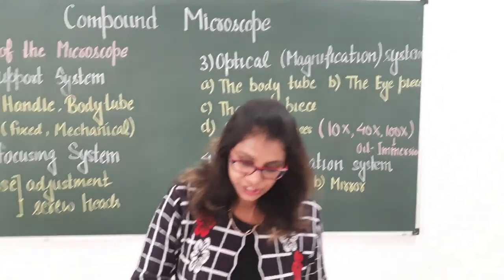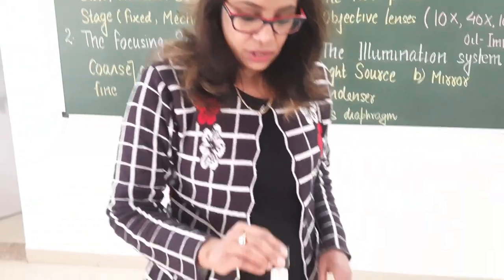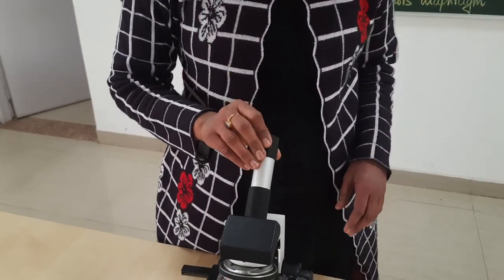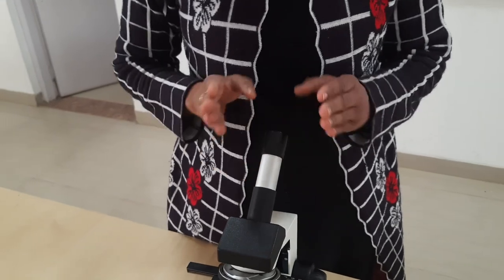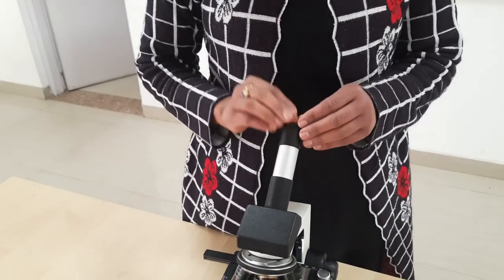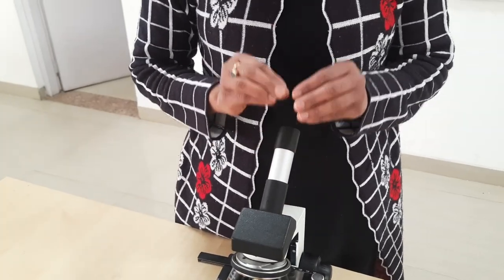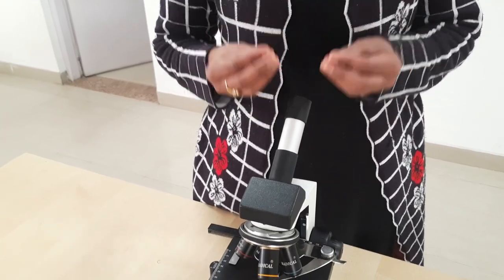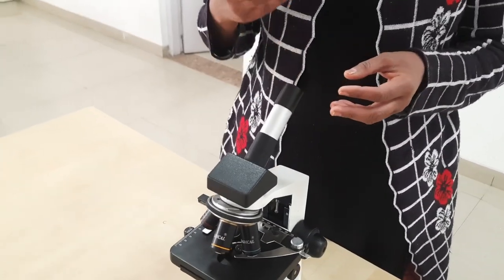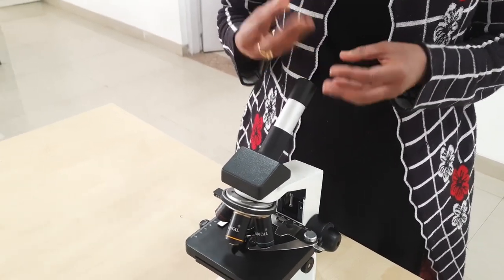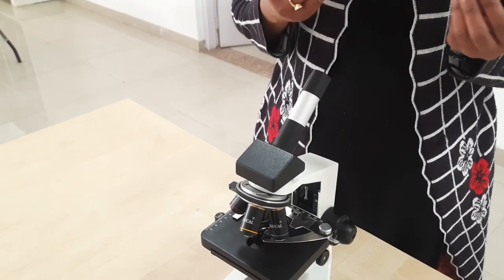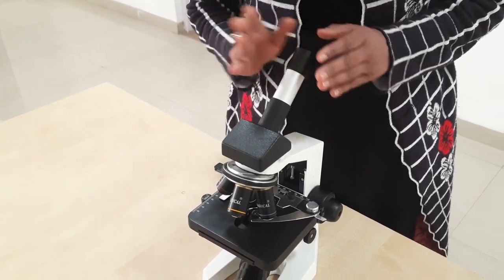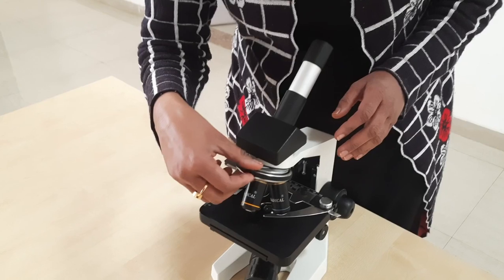The upper portion is known as the eyepiece, which contains the lens known as the eye lens. The power of the eye lens in this microscope is 10x, though it may vary — some microscopes have 5x, 6x, or 8x eyepieces.